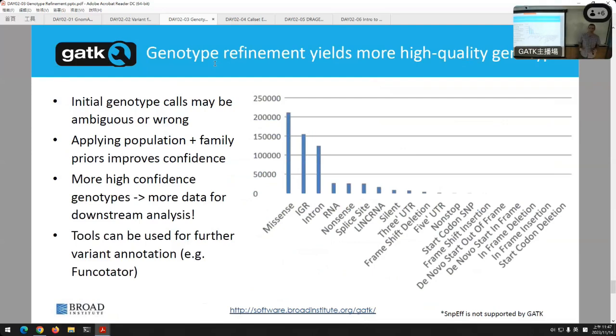That most of the mutations that you find in exons are actually synonymous, and the ones that went away were the ones that we did not expect to be there in the first place. Okay, so we skew now towards normalcy after we refine the genotypes, and we see the distribution that we would expect to see.